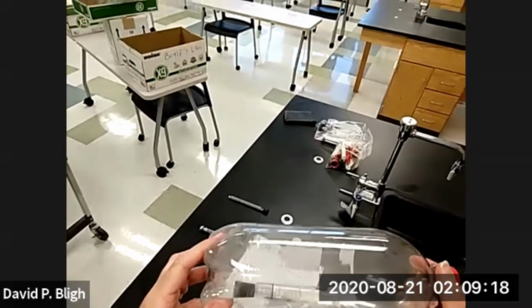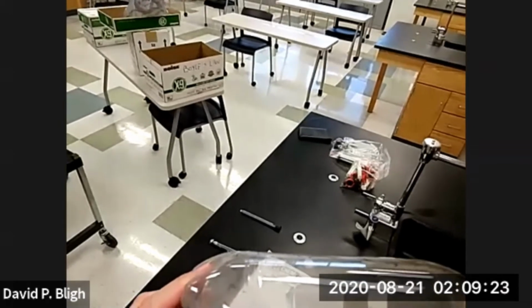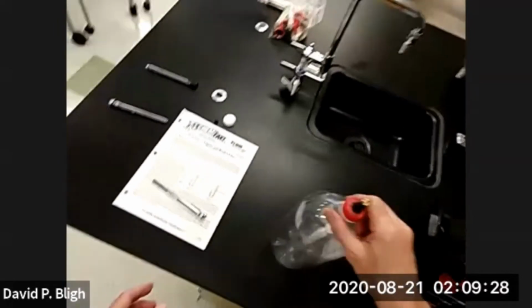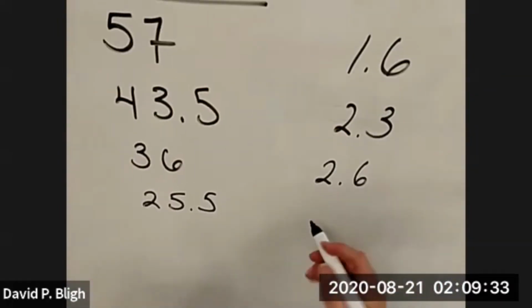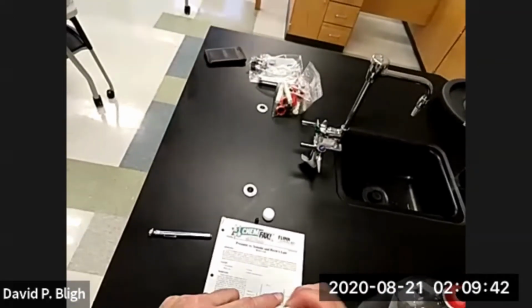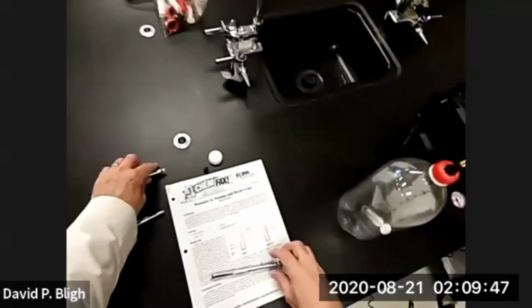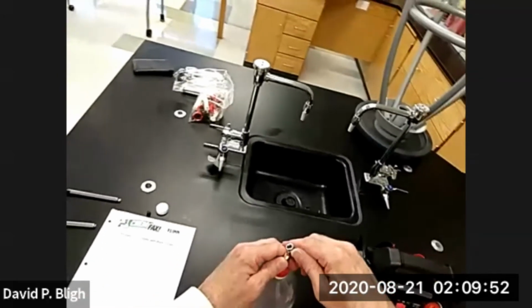All right. That looks like 3.4 milliliters. All right, 25 and a half. Let's see what the low range is set for. Low range kicks in at 20 psi. So we'll get at least another one out of the mid-range. Let's let some more air out.